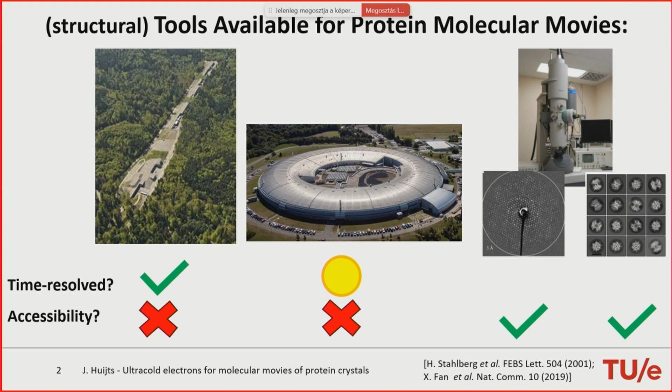And you can look at proteins doing crystallography, like people did in the 70s, 80s, basically before the advent of cryo-EM. And this instrument is obviously very accessible. All major universities, research institutes have such a TEM, at least one in the basement. But the temporal resolution, we'll see two talks on Thursday on time-resolved cryo-EM, where I think the record of Ulrich is that he goes down to about a microsecond.